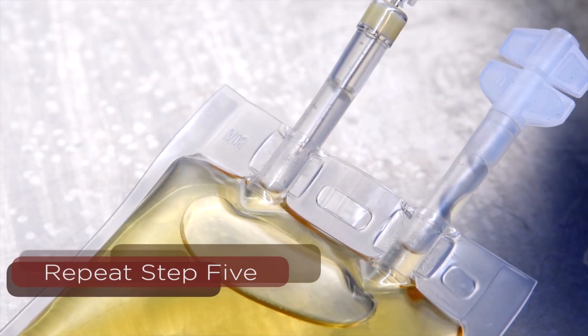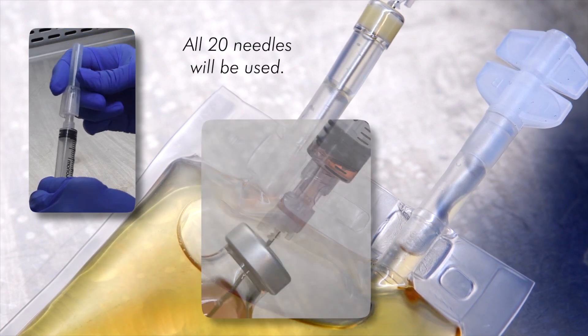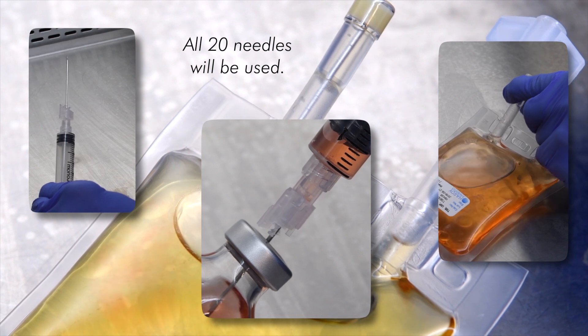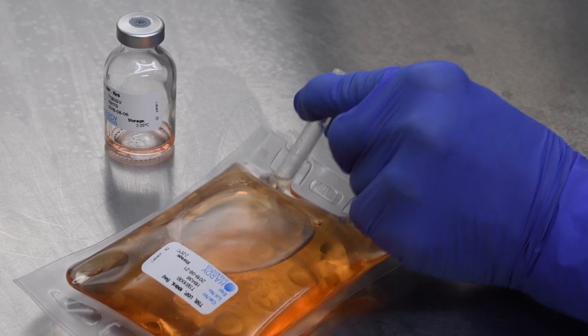Repeat the procedure in step 5, changing the needle after each transfer from the TSB serum vial to the TSB bag using the remaining needles as needed. The final transfer should empty the contents of the TSB serum vial.